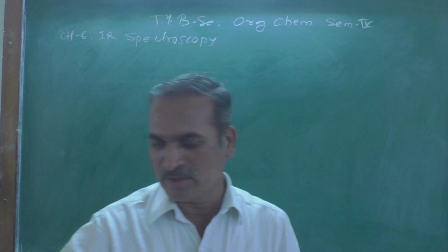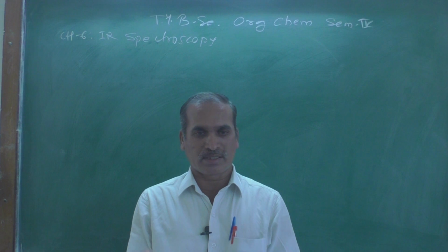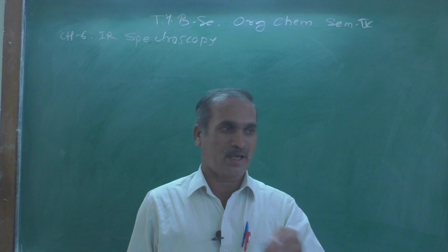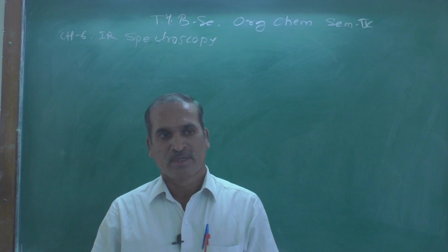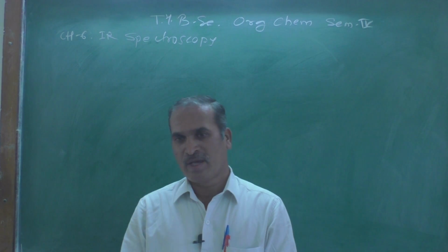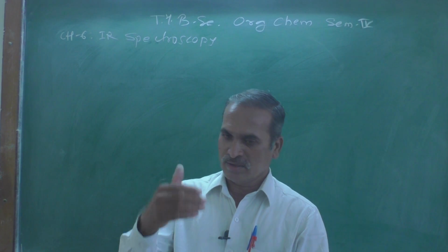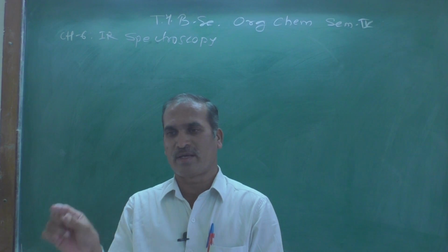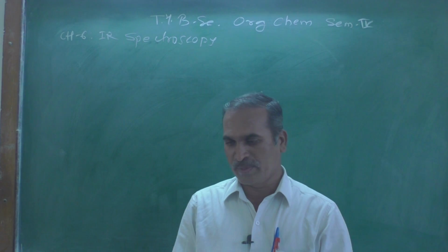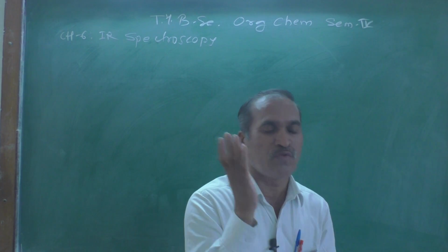Do you remember what we were discussing yesterday? I think we were discussing how to solve problems based on IR spectroscopy. Everybody knows that spectroscopy means what? The interaction of electromagnetic radiation with matter is known as spectroscopy, and IR spectroscopy corresponds to functional groups.